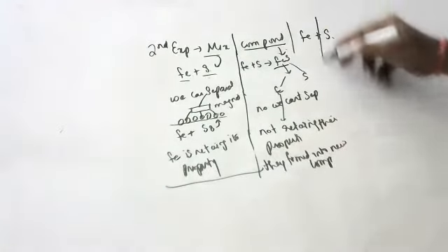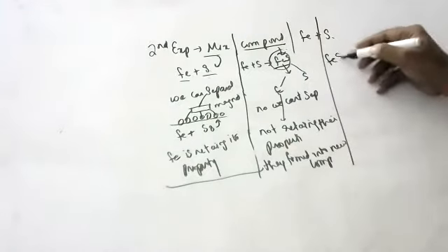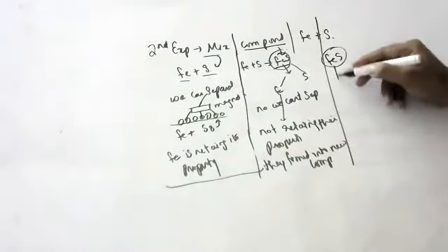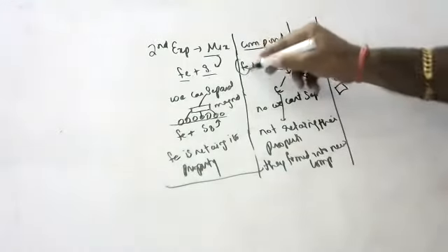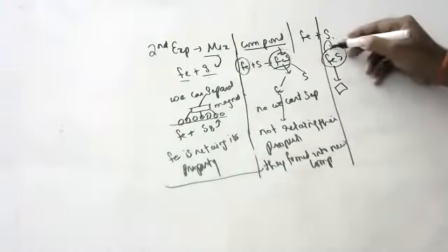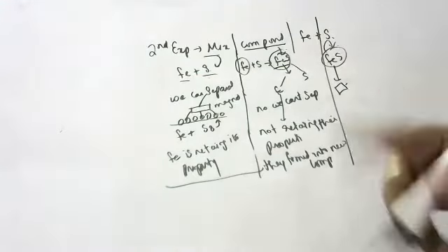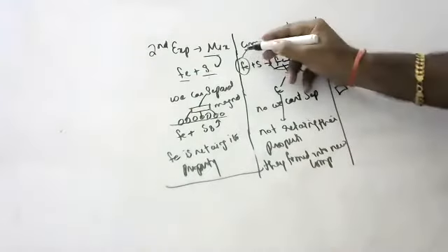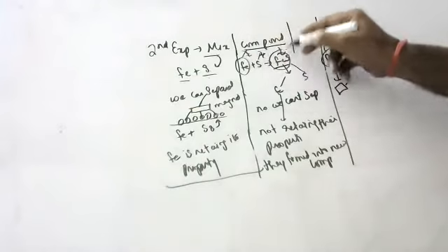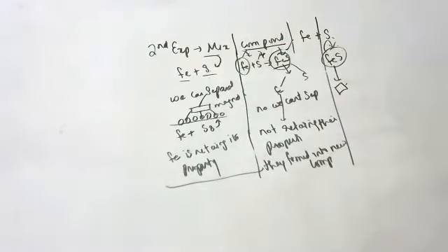Children, try to understand. Iron and sulphur are there in iron sulphide, but they will have a new set of properties. Individual iron gets attracted to the magnet, but once they form iron sulphide, it will get a new set of properties. In a compound, they lose their individual characters and get a new character. Whereas in a mixture, since they are not reacting chemically, they retain their properties, children.